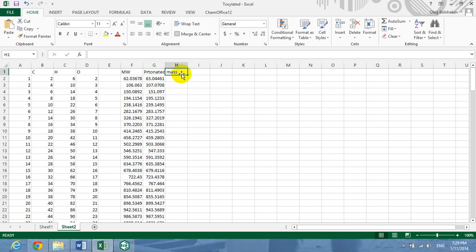Now next, you also asked me if the molecule can be detected as one with a molecule of water. Make sure that the molecule of water has been added to the protonated one, because otherwise it's not going to be detected. It should fly in the magnetic field and thus has to be protonated to be detected.